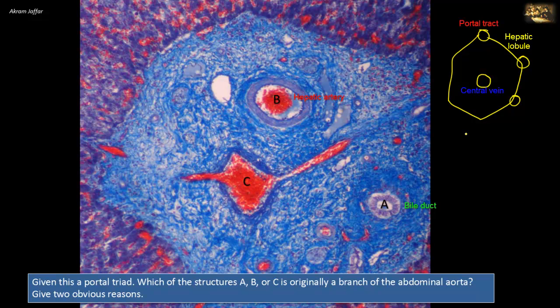B is the artery. It has a smaller size and thicker wall compared to the adjacent branch of the portal vein in C, which has a thin wall and therefore a distorted shape. The artery has a thicker wall containing more muscle fibers and more elastic fibers, so it appears more uniform and not distorted. Being lined by endothelial cells, not cuboidal cells, having a thick wall and uniform shape — these are the two reasons that identify this circular profile as an artery of the portal triad.